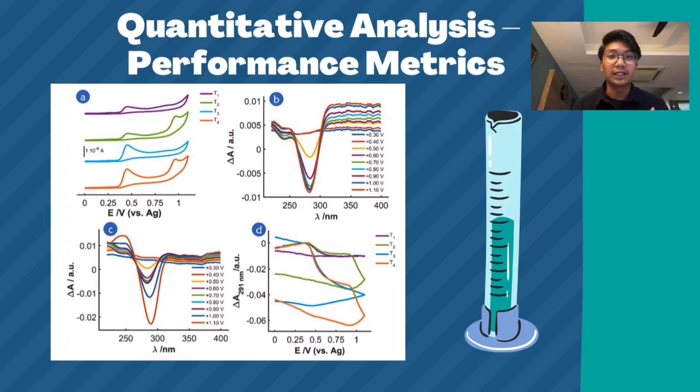At first, they used a univariate model which gave a determination coefficient R² of 0.94, but it wasn't very reliable due to overlapping signal with uric acid. Then they applied a multivariate method called PARAFAC, which is parallel factor analysis, which allows a better separation of signal.